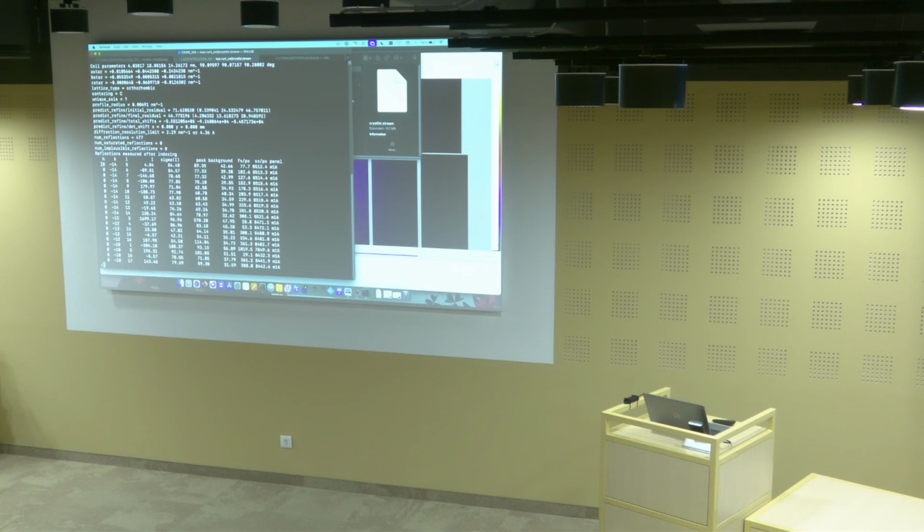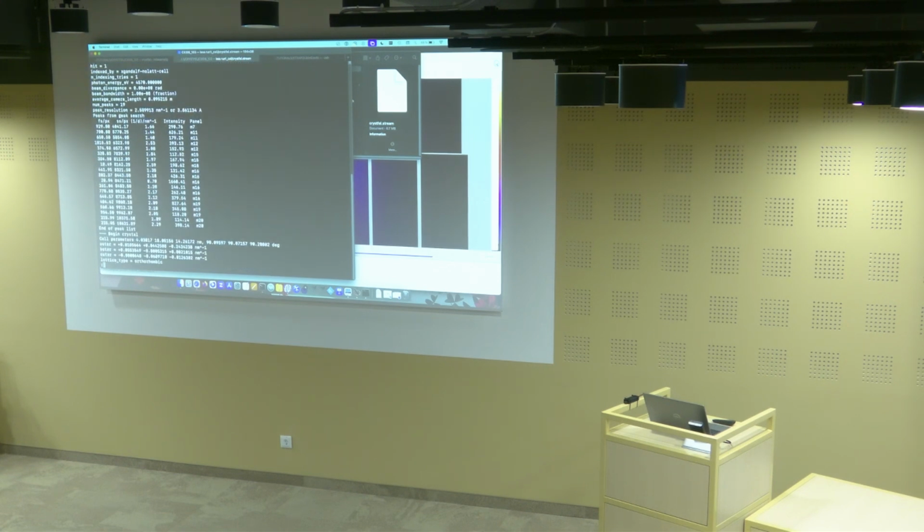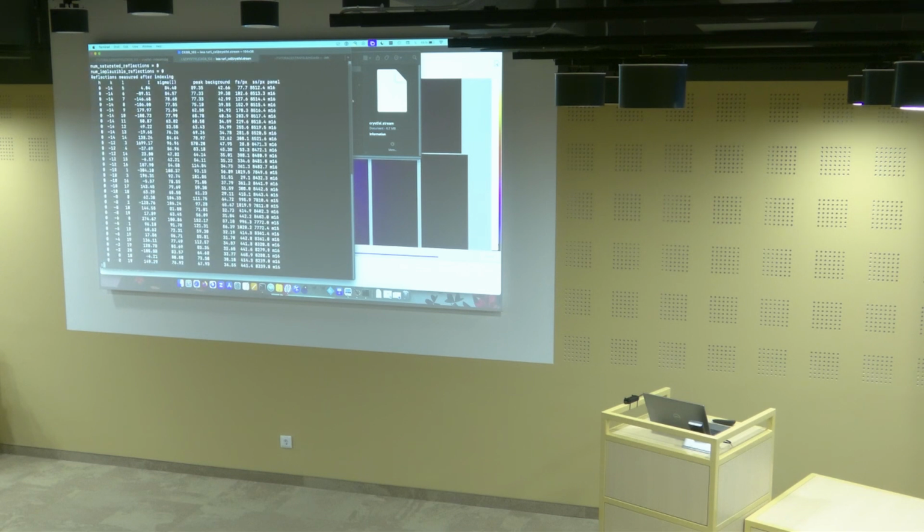And then we have this information about the reflections. So for each reflection, we have their index, HKL. We have the intensity, we have the sigma, and then we have more information on the peak, the background, and where they could be found on the image. So we basically have a whole list of peaks, right? Remember, for this one, we only had 19 peaks, and still we found a lot of reflections.